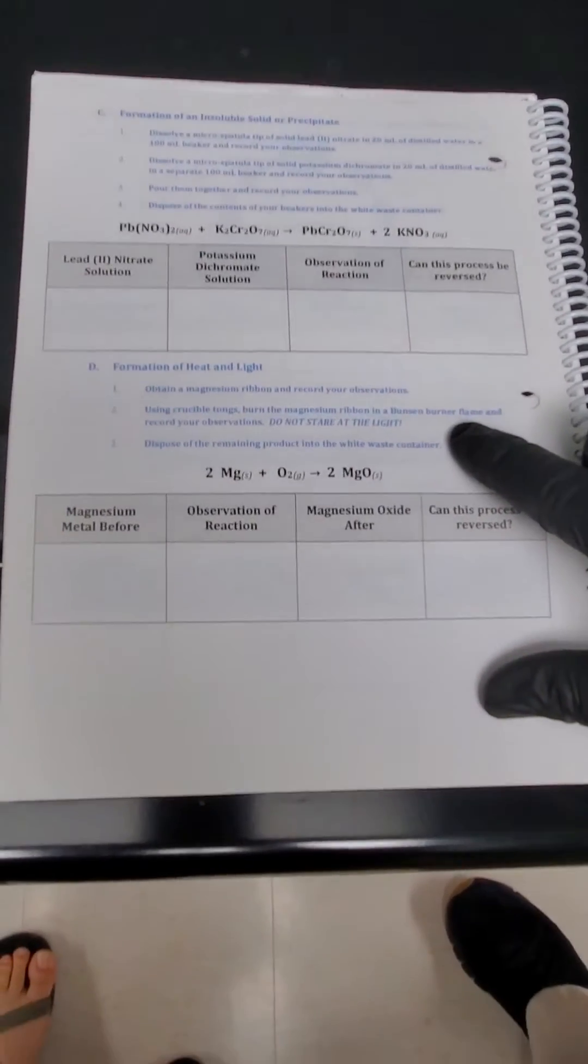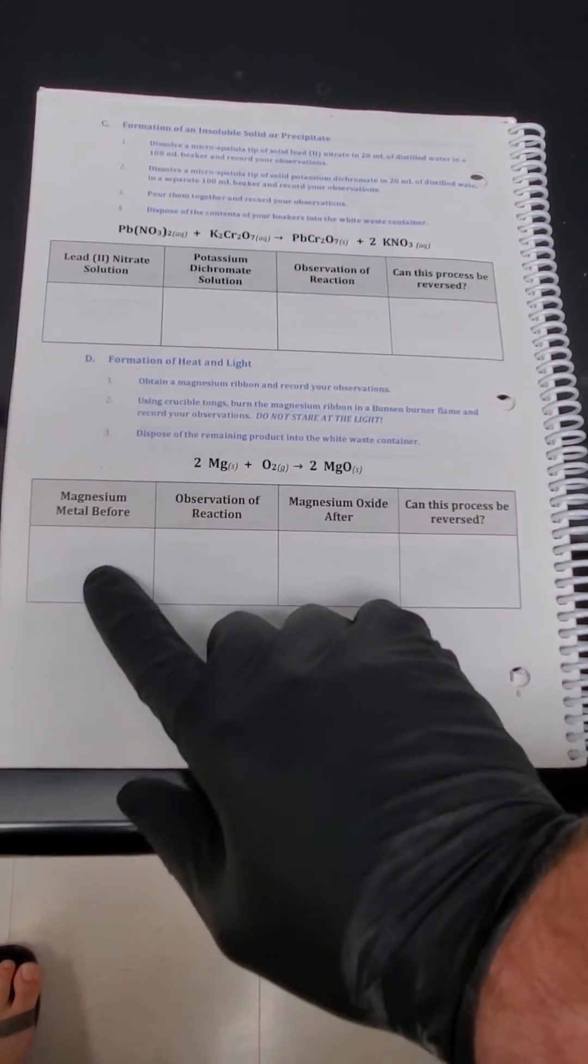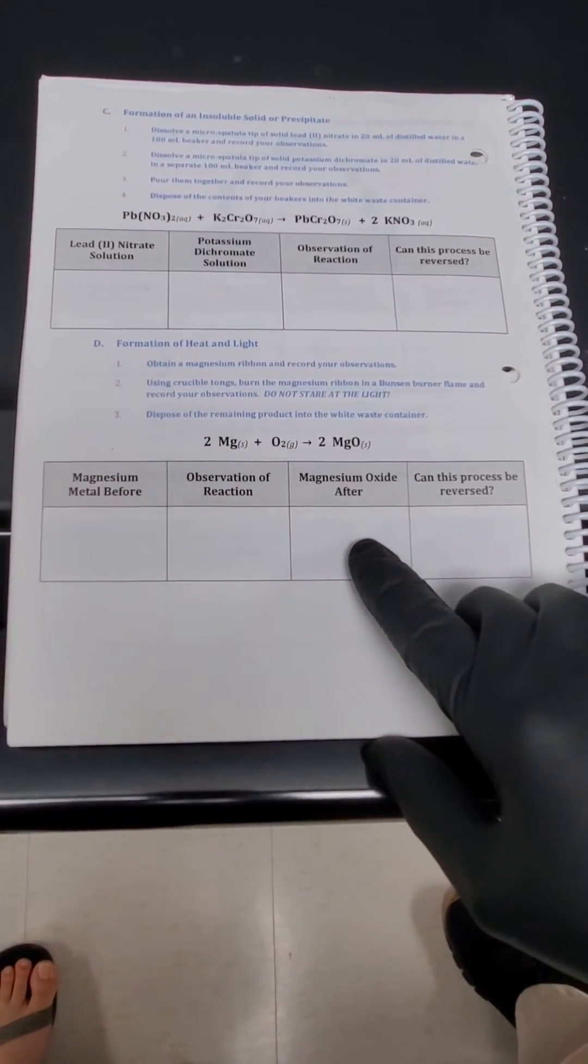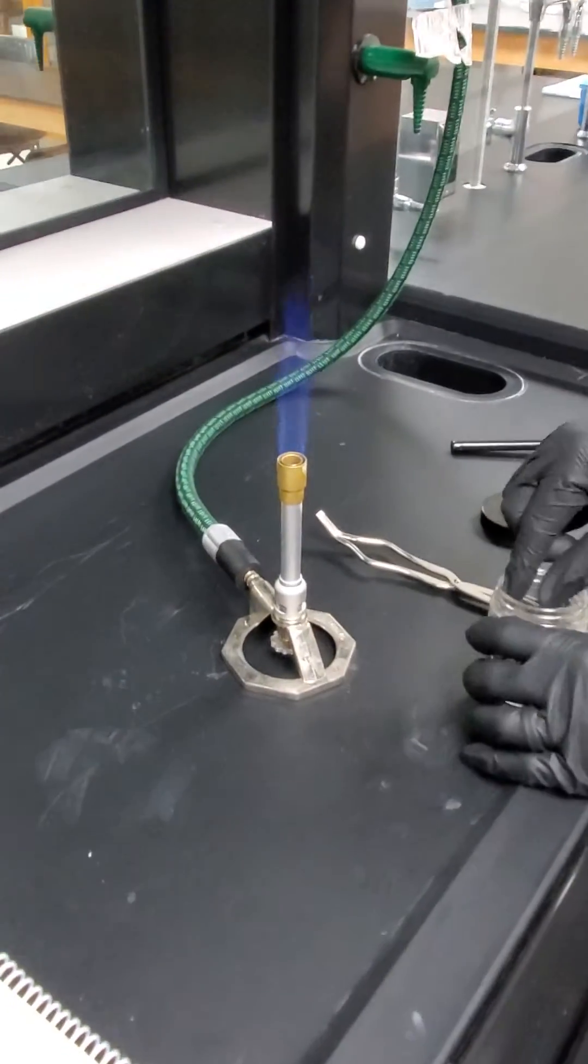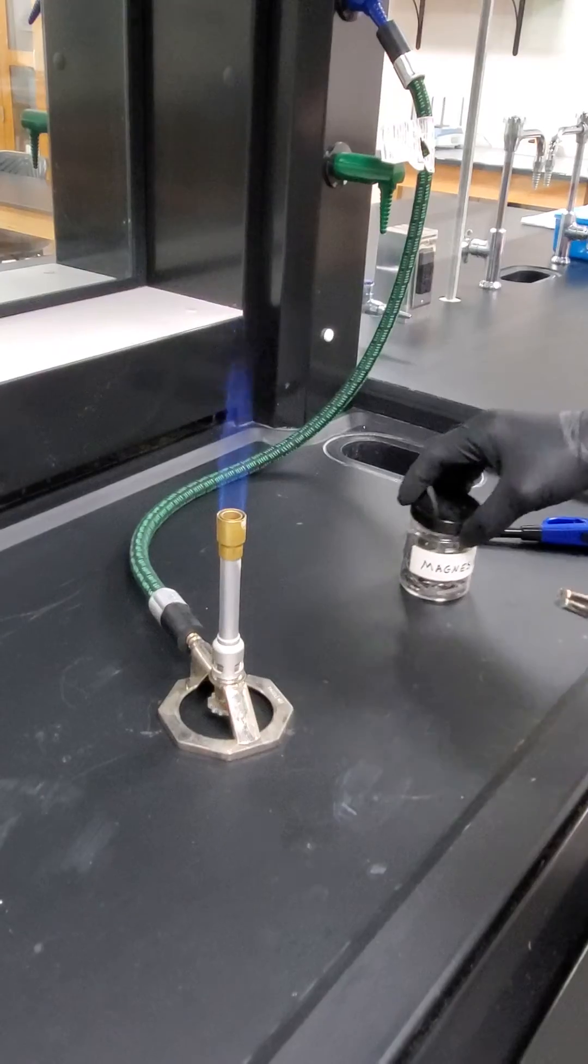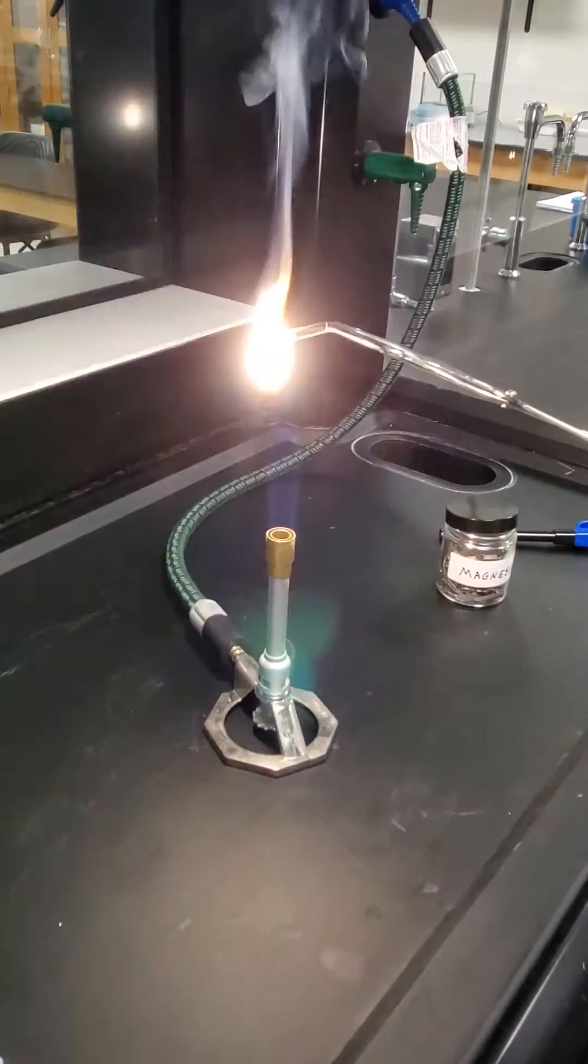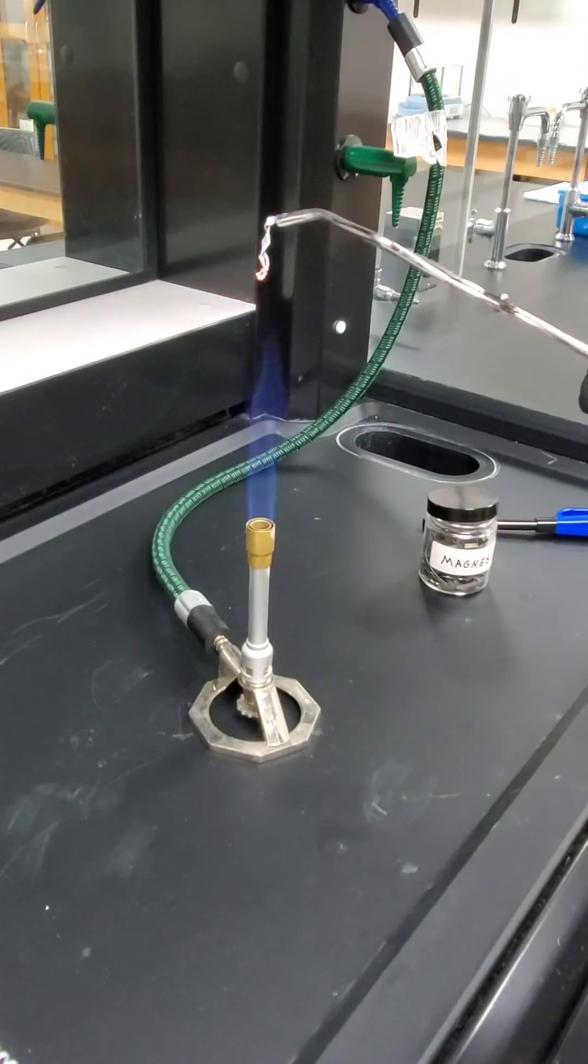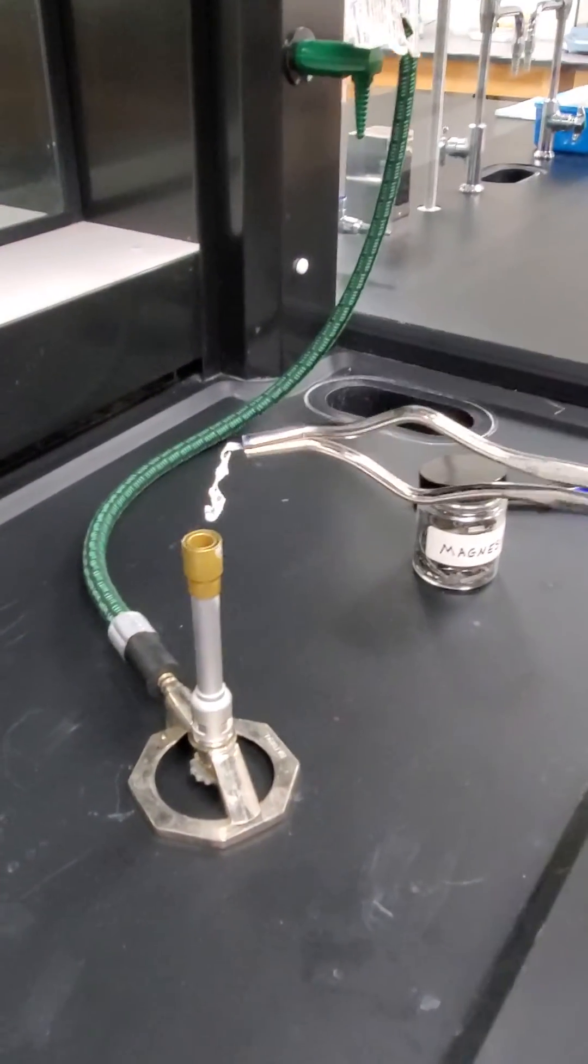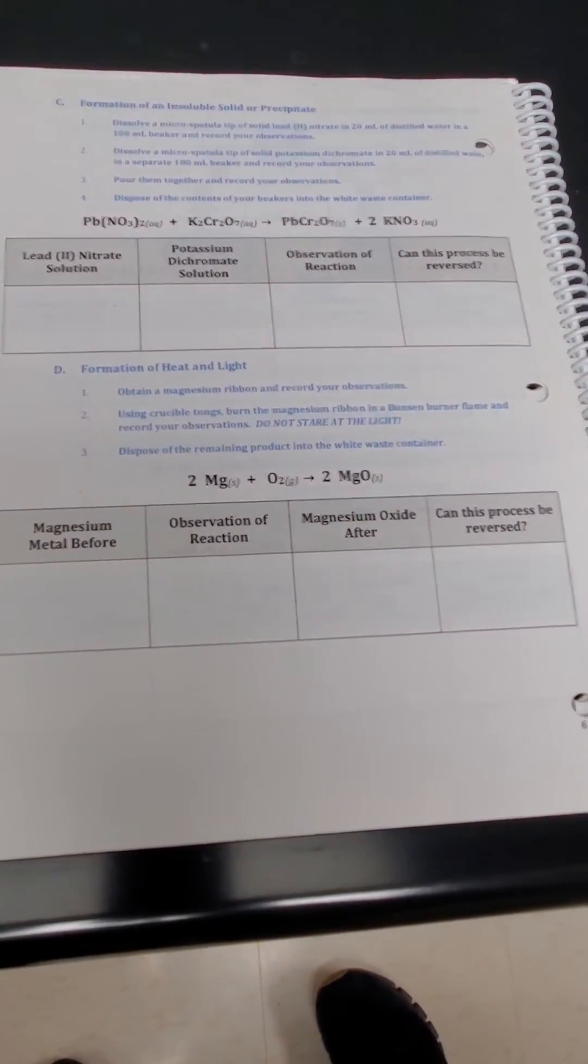Alright last experiment part D. We're going to look for some heat and light. We're going to take magnesium ribbon and light it like a firework. It's going to react with oxygen. And see again the magnesium before, what happens during. And then think about could we go backwards to that original magnesium. So here's our magnesium. Small little gray metallic piece of metal. And then we're going to light it like a firework. And notice very bright, very intense amount of heat almost like a welder. And what remains is something that looks kind of solid but not. So again, look at the magnesium oxide we just saw. Kind of white and kind of dusty at this point. And then think could you go back to that original magnesium that we started with. And that's the end of this experiment. We'll jump to talking about the questions next.